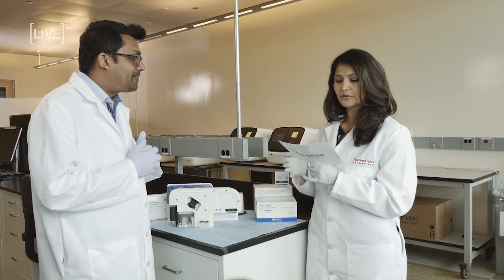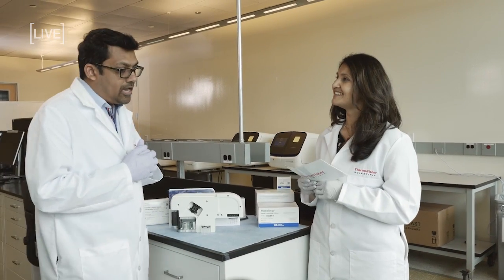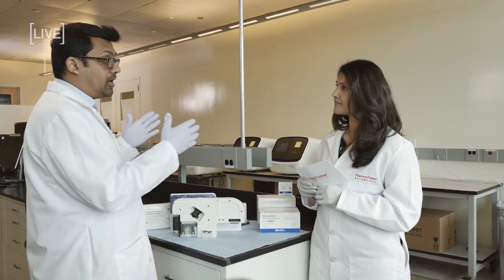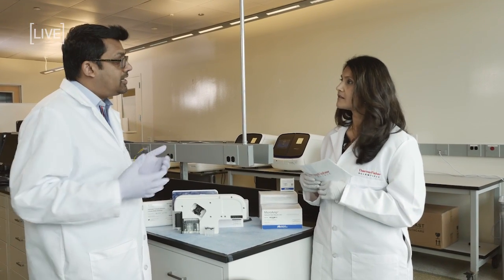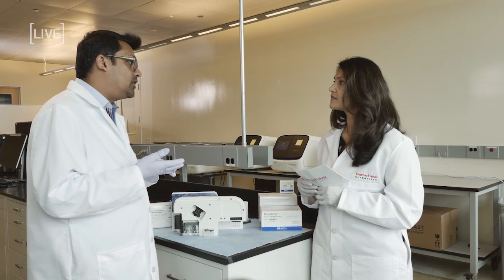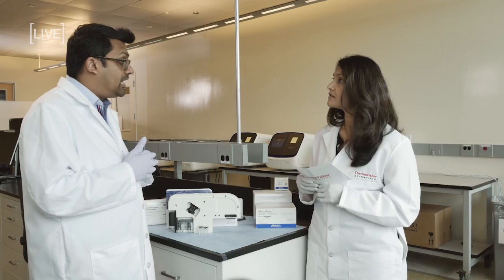Wow, that's pretty cool. So what happens once you open the box? Yeah, absolutely. So when the customer is all set up and they know when to expect the FSE, they will come in on day one. They will unbox the instrument, place the instrument on the table wherever it belongs per the customer's expectations, and then perform the installation. They will do the install run, and they will walk the customer through the basic installation steps, the basic maintenance of the instrument, and other aspects like that.